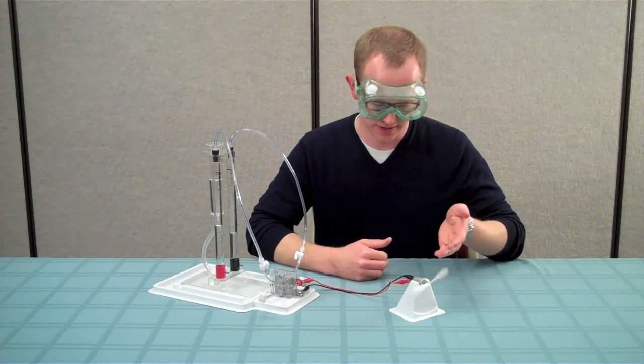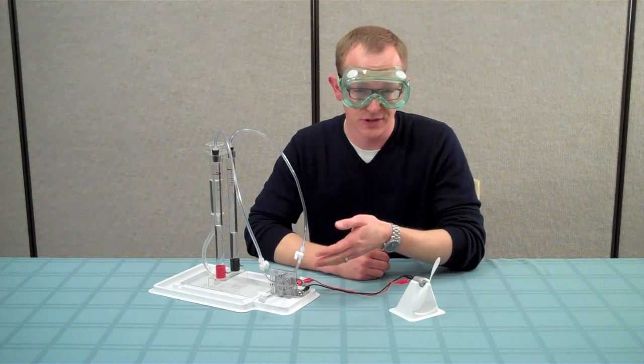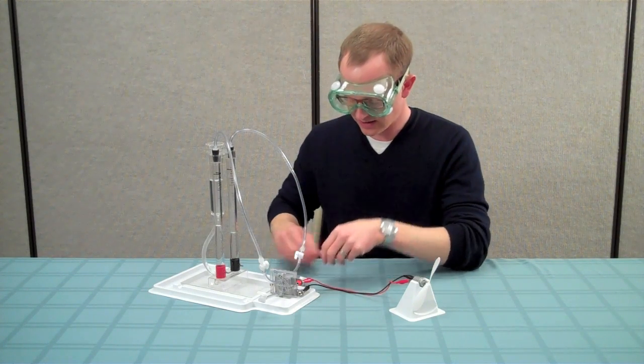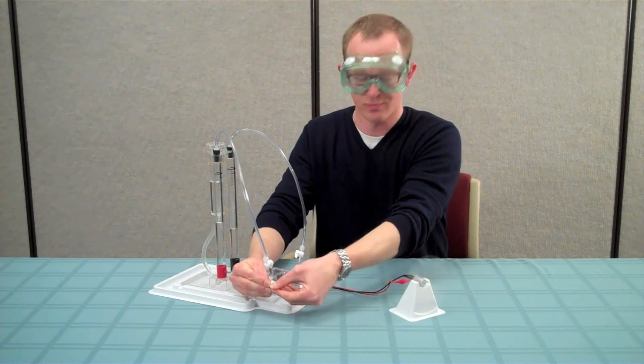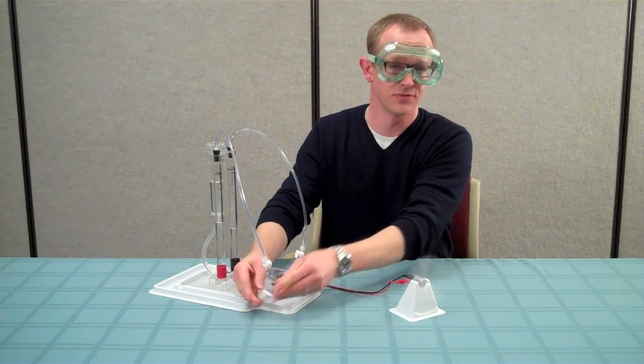If the electric motor starts to slow down, or the voltage across the fuel cell begins to decrease, you may need to give both purge valves a quick half turn. You may need to do this several times while running the fuel cell.